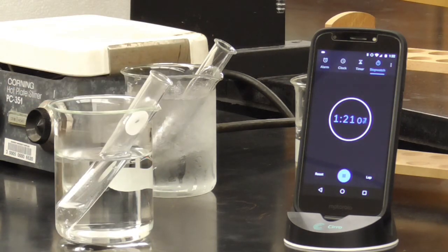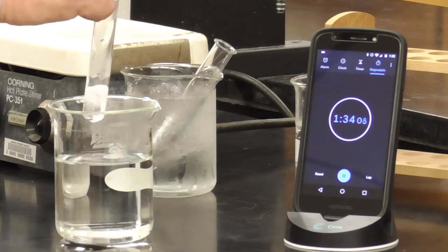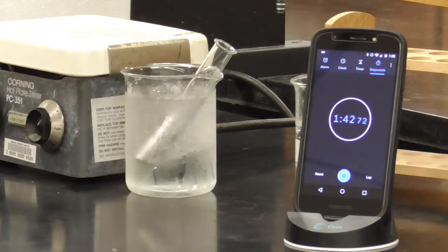Not quite, almost. Okay. There's just a little bit of metal there, so I think we can call it at that time right there. So quite a bit faster when we did it at the hot temperature.